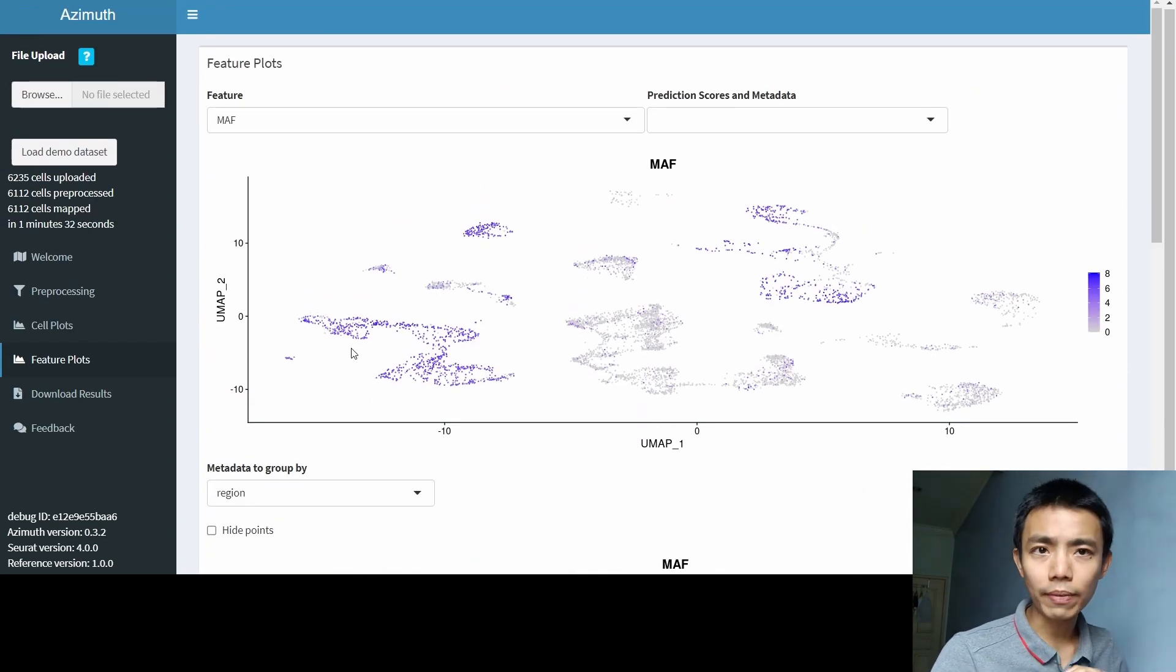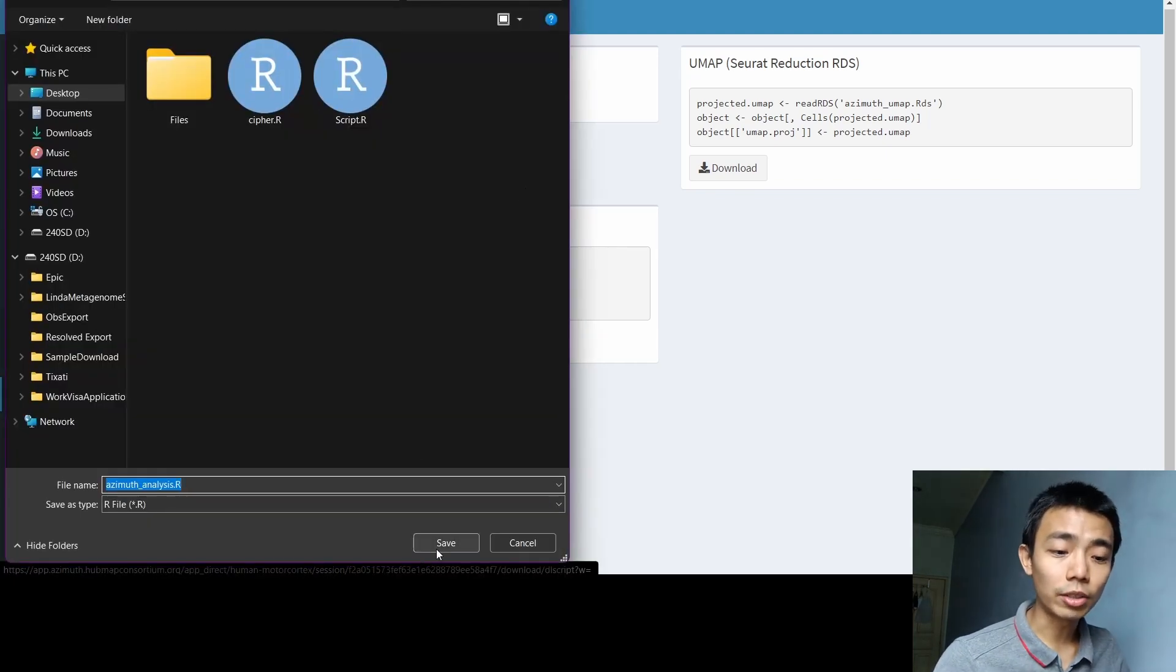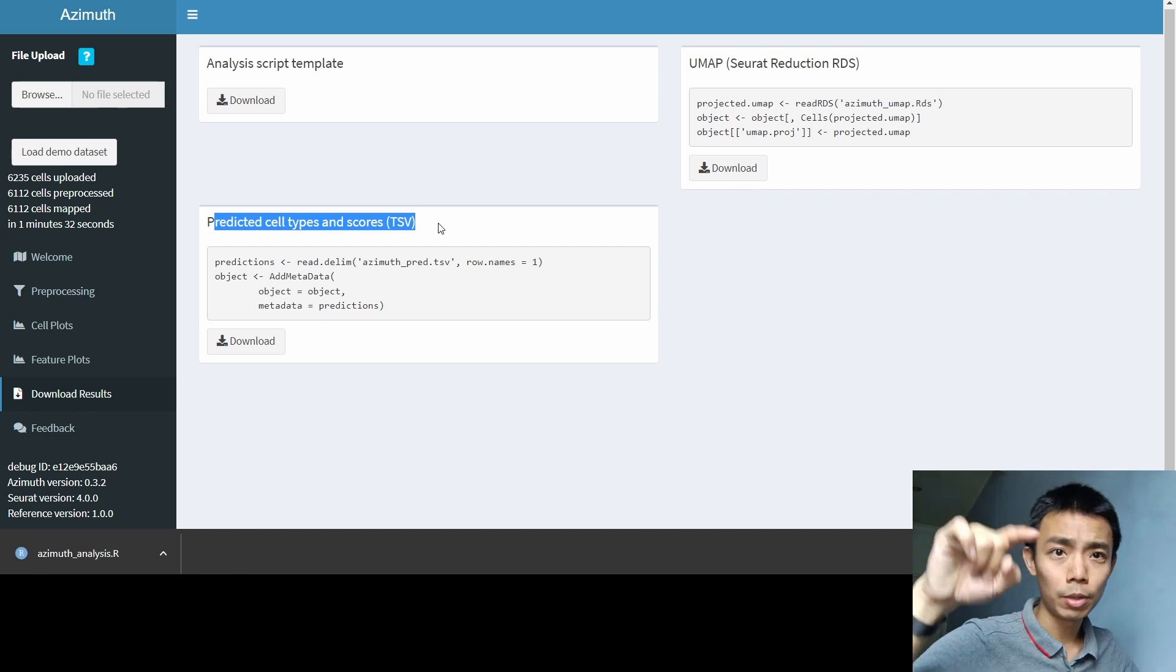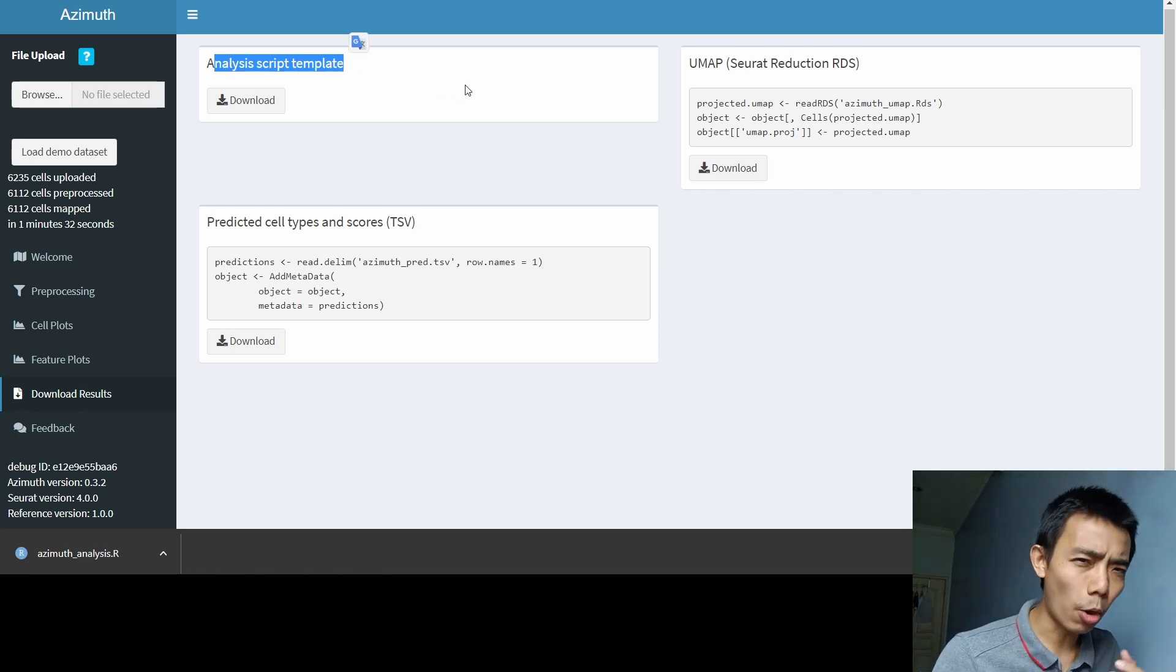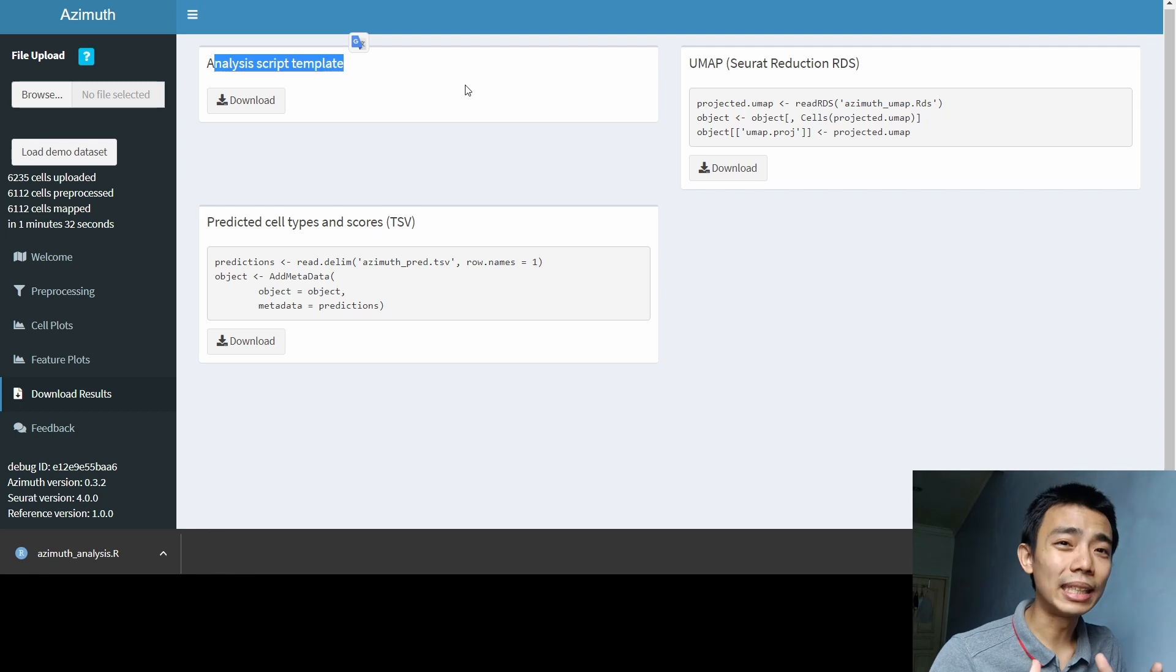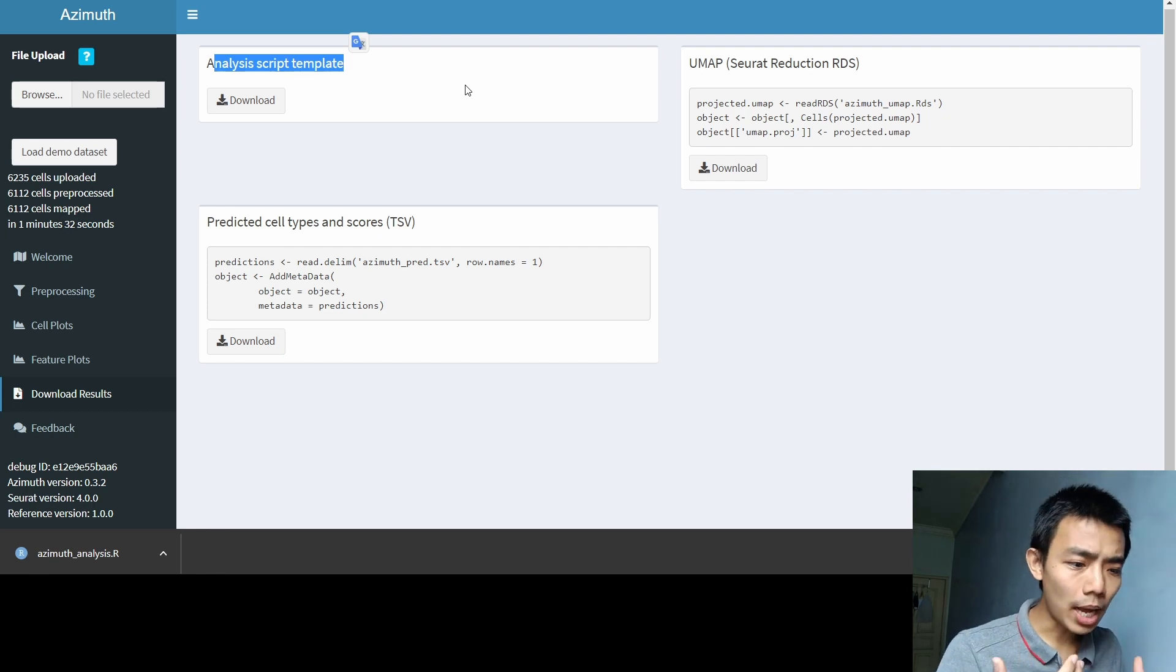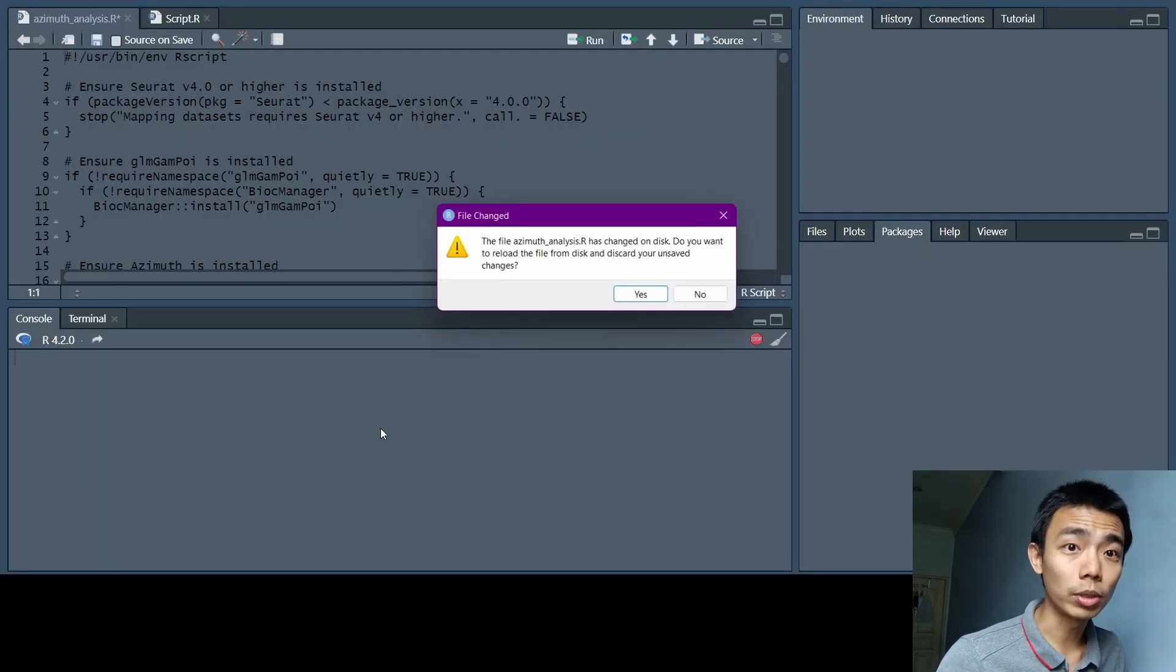My favorite part of Azimuth is actually here, the download result, where you can actually download the analysis script template as an R script. And you can download the UMAP as a Seurat Reduction RDS and a particular cell type as score, which is what we see in the table above where you can do a dropdown. But the most important part is the analysis script template. Because Azimuth, I believe, is not created as a be-all and end-all, as that this is the thing that really can replace R completely. But rather, it serves as a front end for people to explore the data. And once they get comfortable with it, they're able to do the further downstream analysis without with less problems. I would say it makes the data a little bit more accessible to common folks.